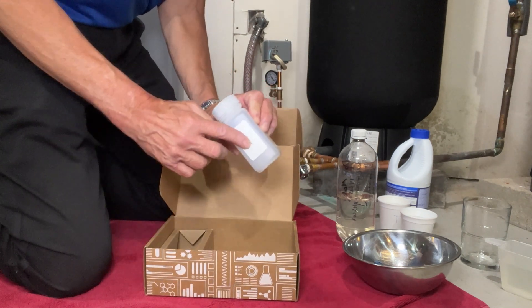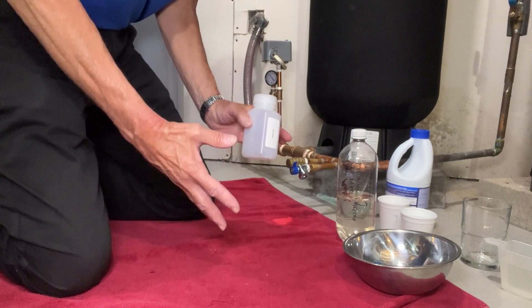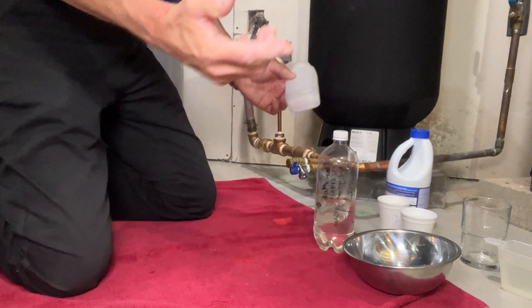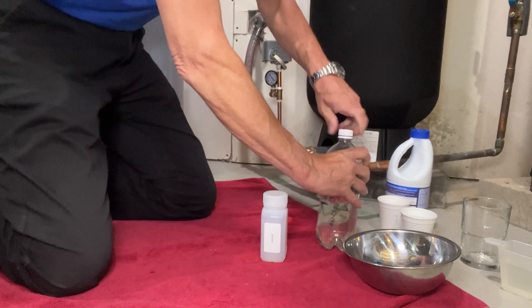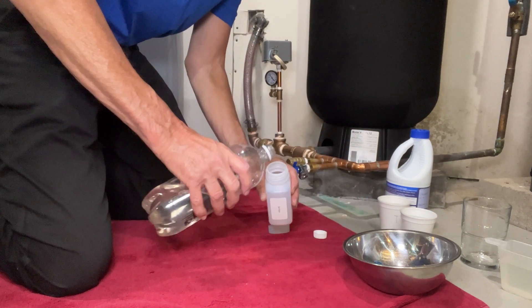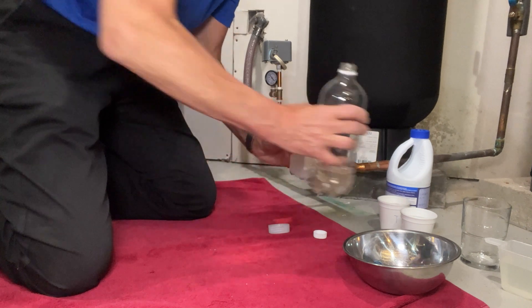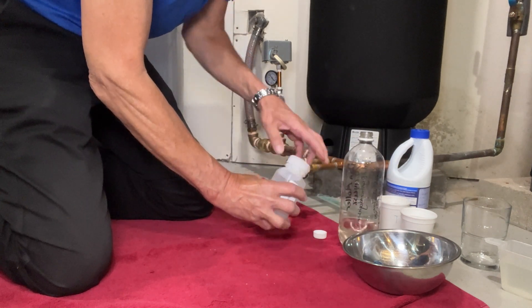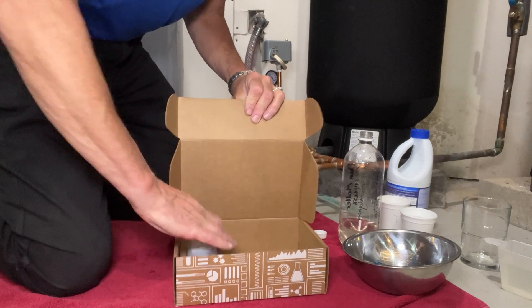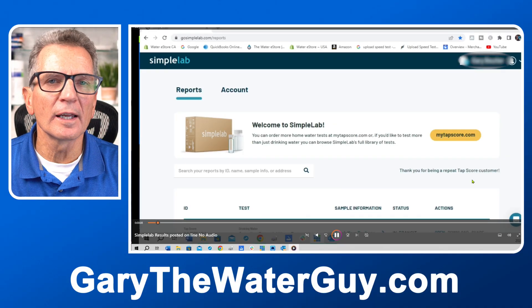Here's the bottle with its code on it. Because I don't have tannins in my water, I have a separate sample that I know has tannins in it so we can see how it comes back from the lab and shows a positive result. Pour the sample into the bottle, making sure not to overfill it but ensuring it's filled up to the shoulder. Close it up tightly and put it back into the box, then fill out the forms and ship it back to Simple Lab.